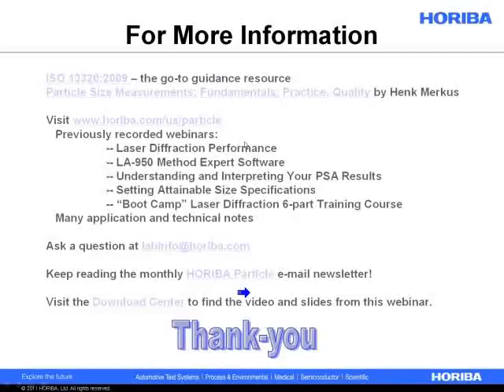Dispersion looks like the distribution getting smaller. Multiple scattering looks like the distribution getting smaller too. But if it's just barely dropping out of the green zone, you're going to be okay. You're not that close to a multiple scattering regime yet.